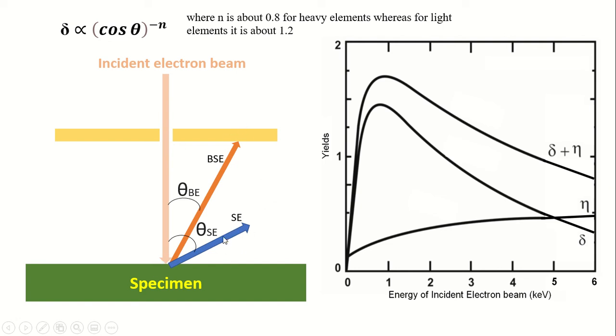So we have these sorts of signals here. Just right there we have a detector to detect these kinds of signals, the secondary electron based, because the secondary electron has less energy compared to the backscattered electrons. So this is the inelastic collision, and for the backscattered electron maybe it is an elastic collision. So this is all about the secondary electron emission.